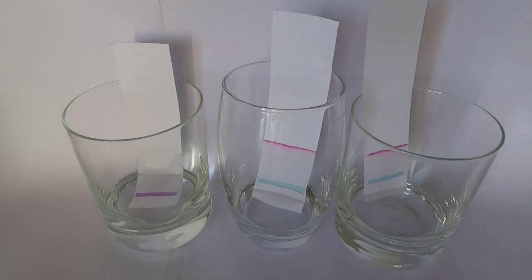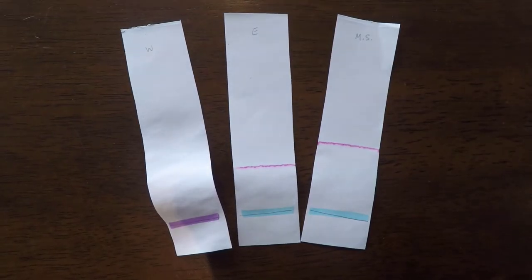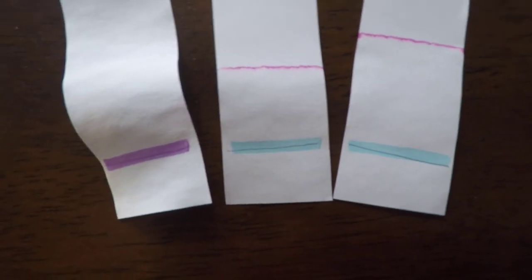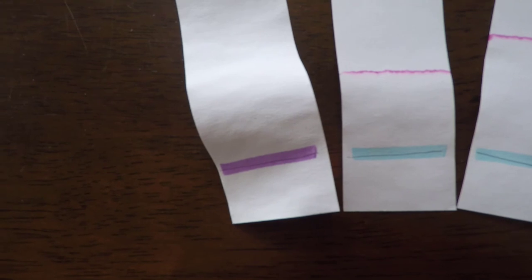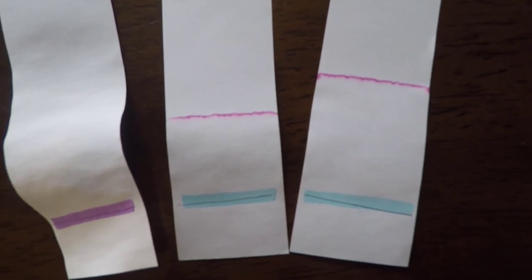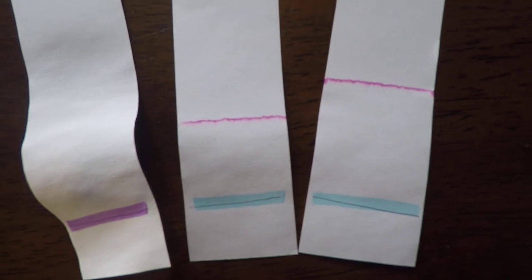Unfortunately I don't have a photo of what the two black markers look like at the end of the experiment, but here's some footage of the three experiments with the purple marker. You can see that the water definitely didn't move any of the purple highlighter, while the ethanol and methylated spirits moved the pink dye quite a bit, but didn't really move the blue dye at all.